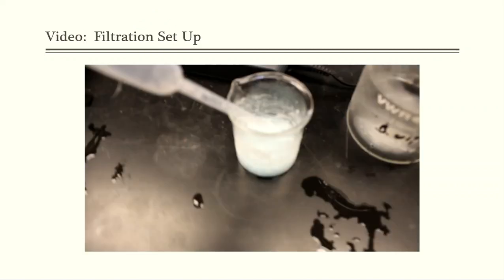So that way it is ready for you to pour your sample through. All right, so here's a video of the process before I actually start it, and it gives you an idea of the filter flask and the Buchner funnel and the water aspirator and kind of everything in motion at this point. So let me play this for you, and that way, again, you can get a visual of what's going on in the lab.